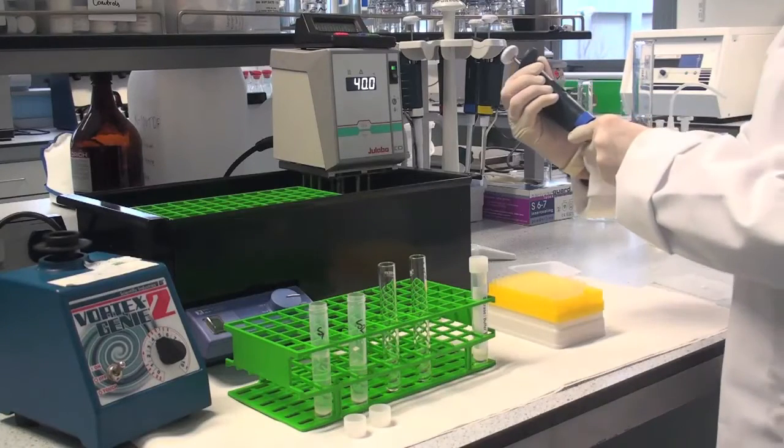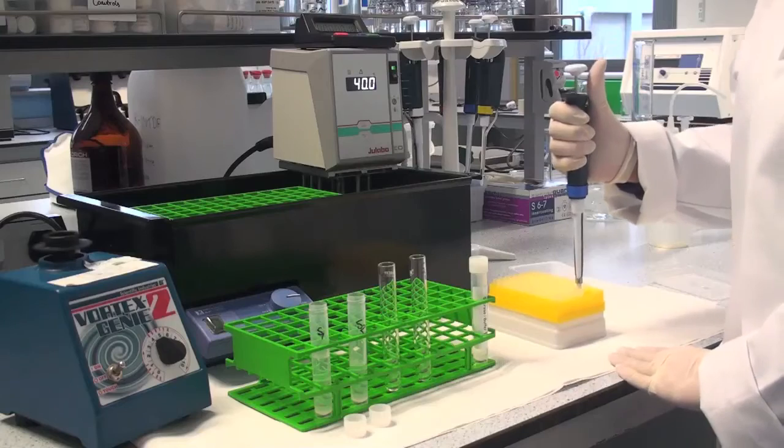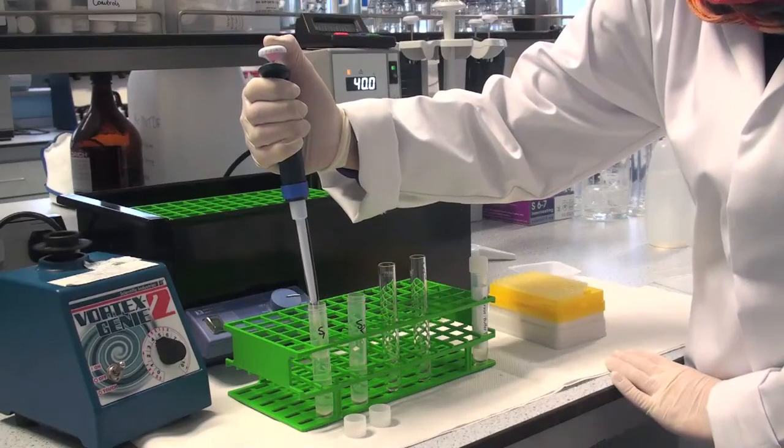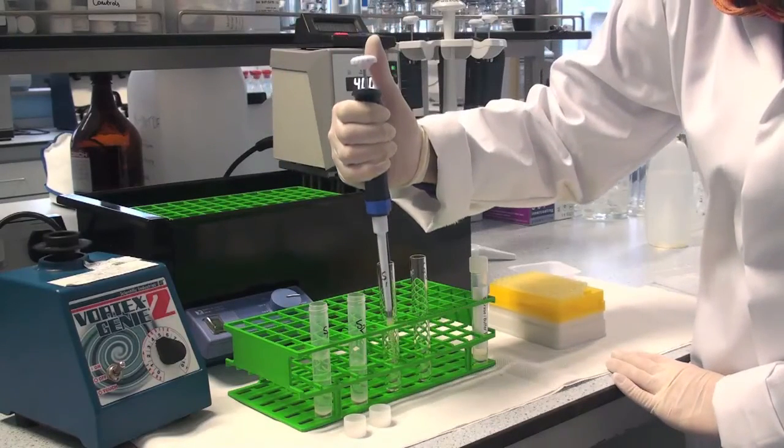Accurately dispense a 0.2 ml aliquot of each of the solutions to be analyzed, which contain between 0.1 and 1 mg per ml of fructan, into the bottom of a glass test tube of 16 by 100 mm dimension.